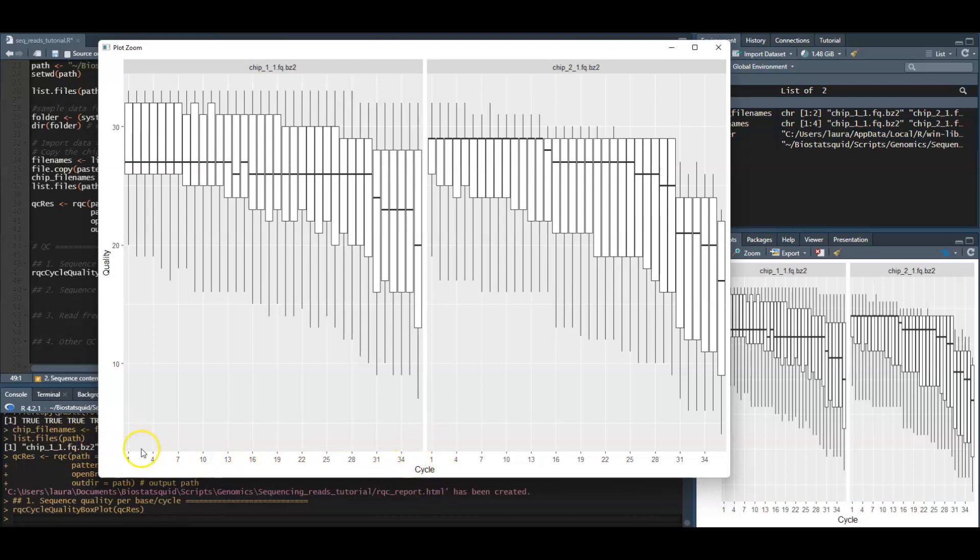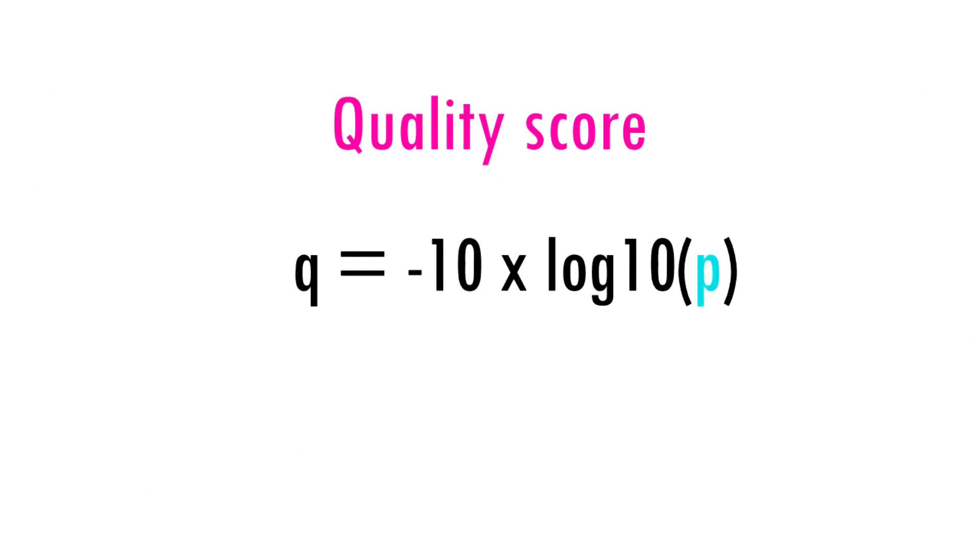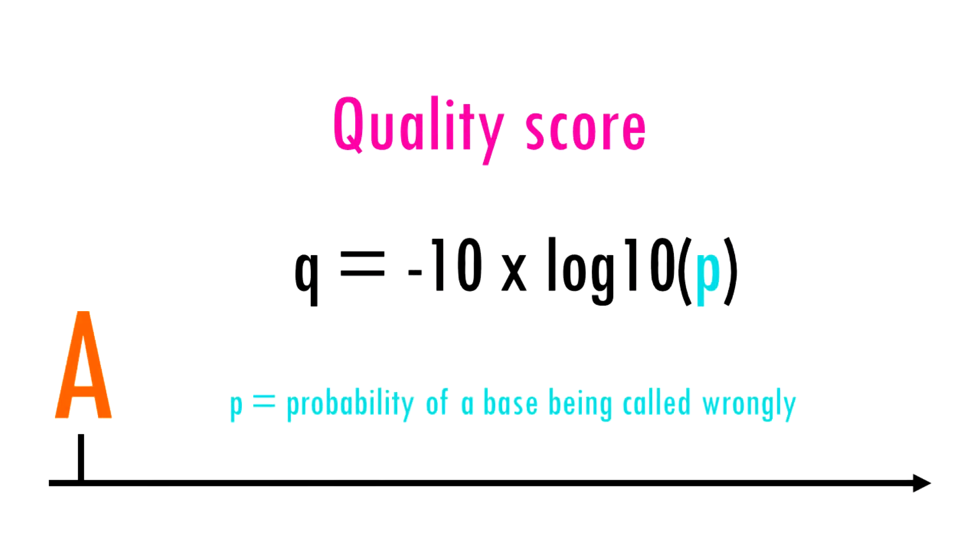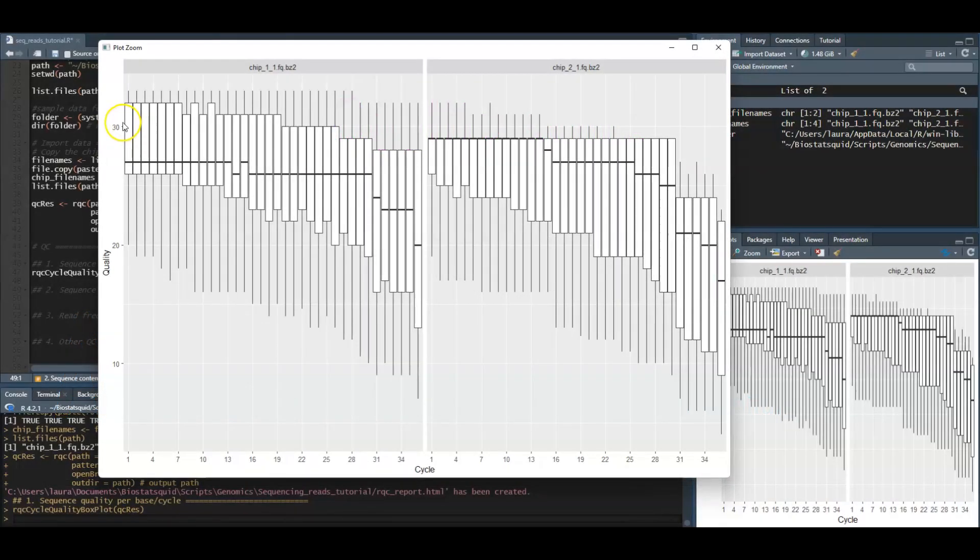We have position one, two, three and so on, in this case up to 36. In the y-axis we have the quality score which is an estimate of the probability of that base being called wrongly. Obviously we want this quality score or Q score to be as high as possible.